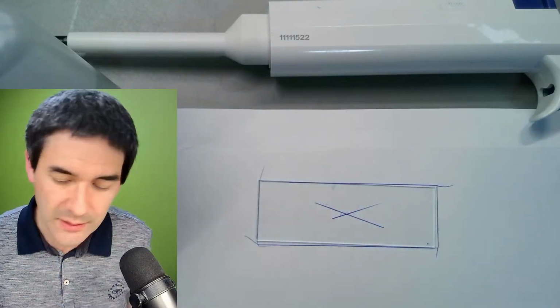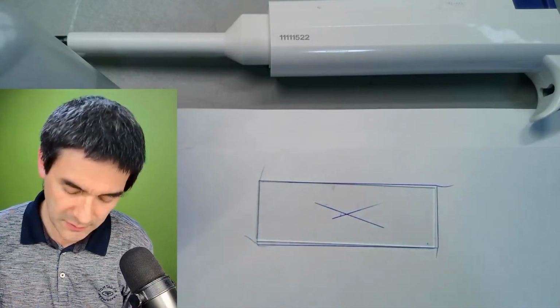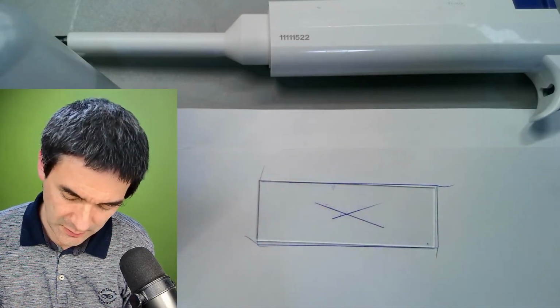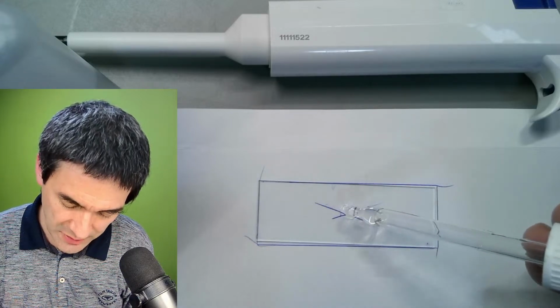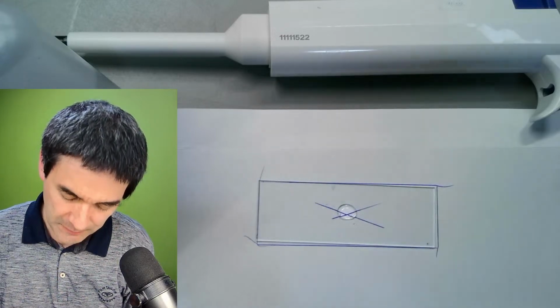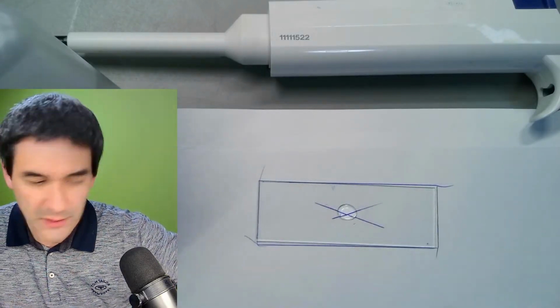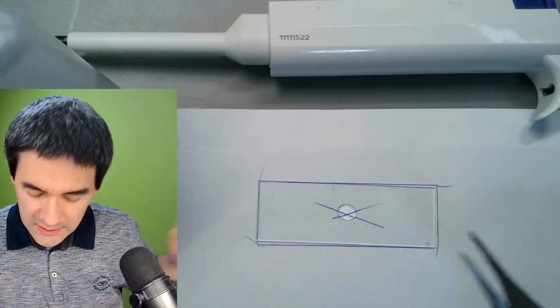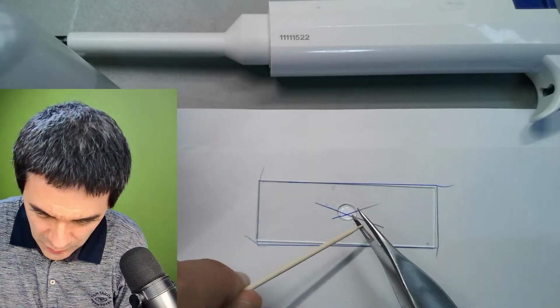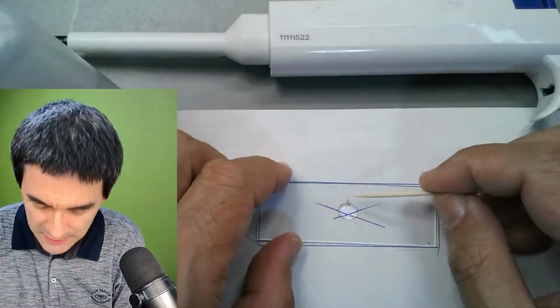So where is the glue? Now we can actually start to apply a drop here. Again, bubbles are always a little bit of an issue. And the next thing is we're going to put in those trichomes, and I would like to take a toothpick. Let's carefully try to, I don't know if you're able to see that.